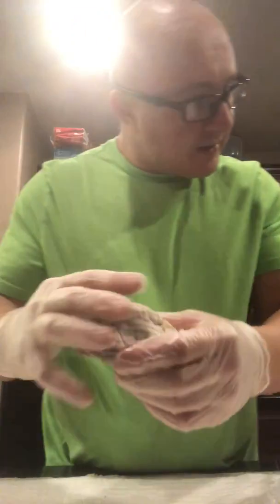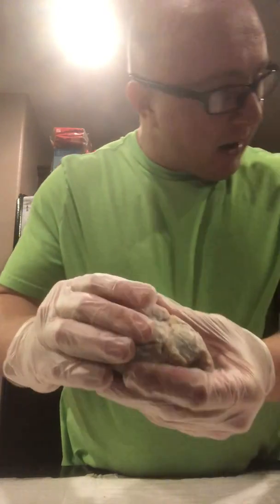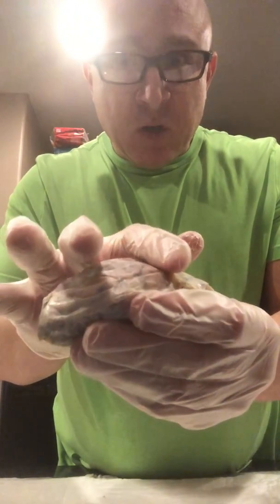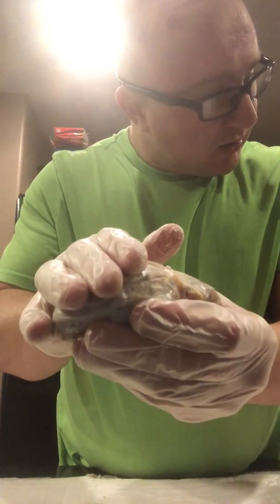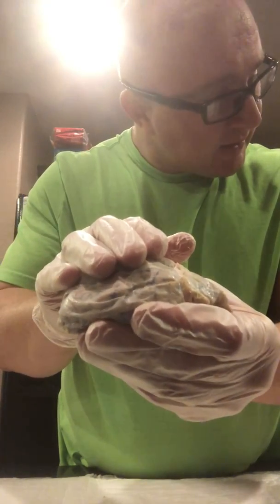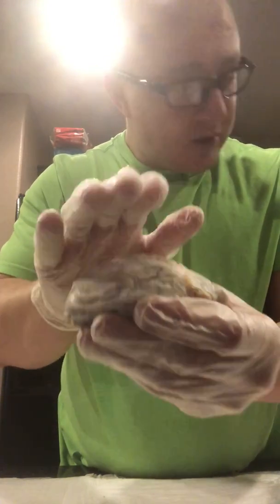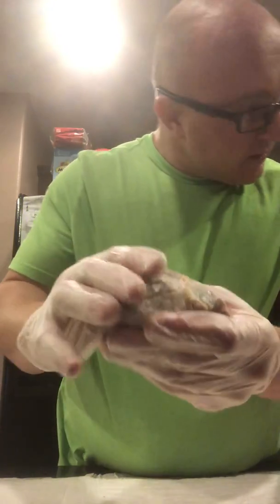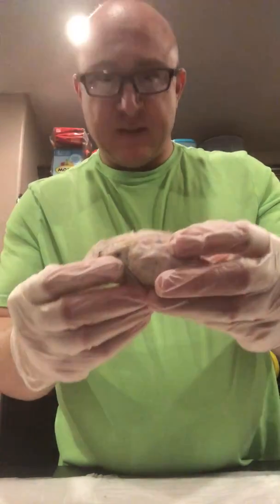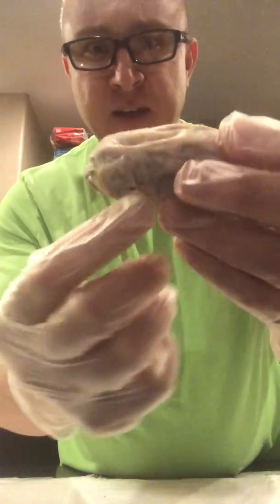The meninges consists of dura mater, arachnoid, and pia mater. Dura mater is going to be the outermost layer, closest to the skull. The arachnoid is going to be below that, and the pia mater is going to be the closest layer to the brain itself. The pituitary gland is going to be, let's see, roughly here.